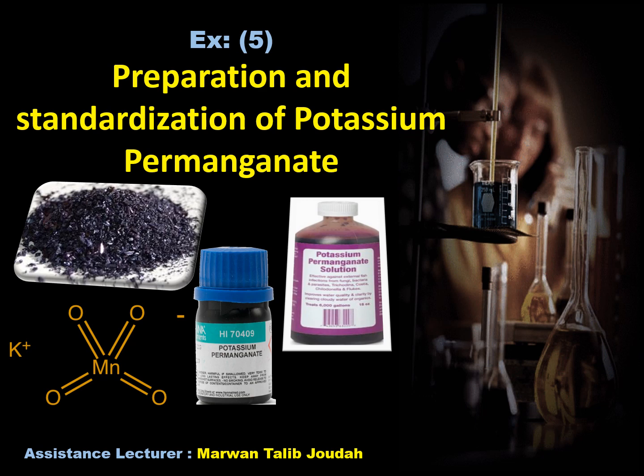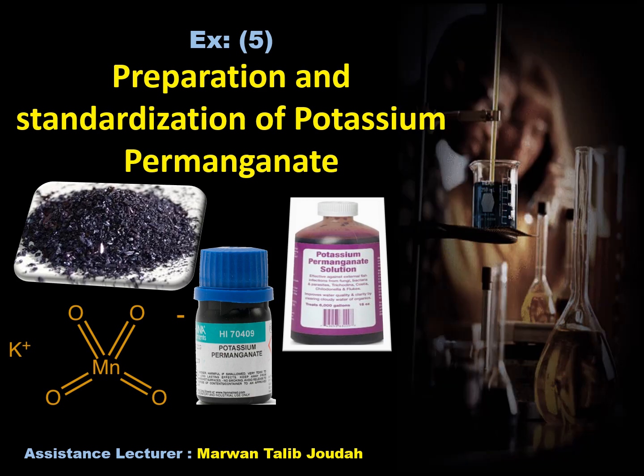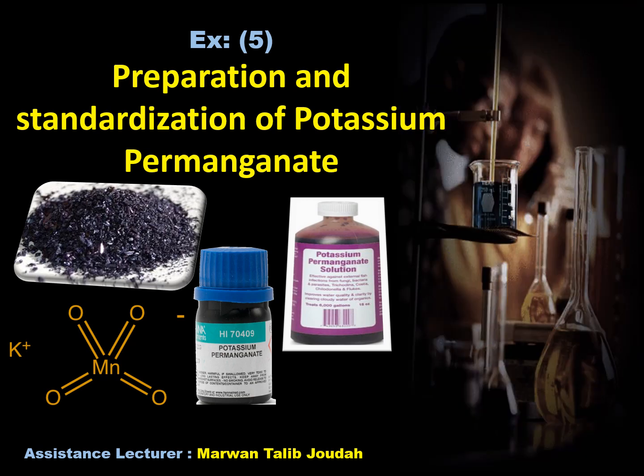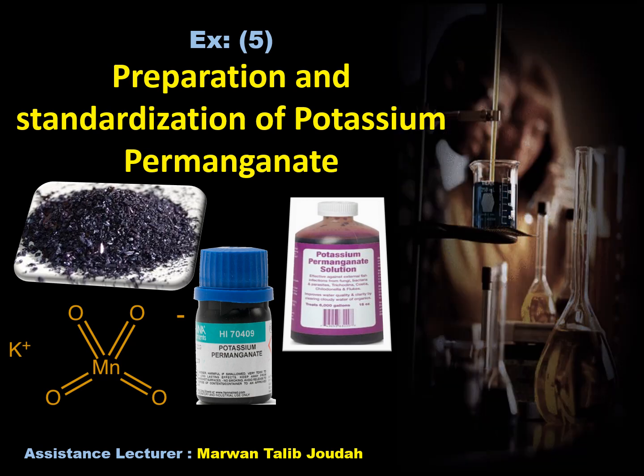تجربتنا هذا اليوم راح تكون التجربة الخامسة اللي هي Preparation and Standardization of Potassium Permanganate. التكنيك راح يكون اليوم اللي هو titration، لكن it's kind of different. اللي راح يصير هنا مو التايتريشن اللي استخدمناه مسبقا. We've had some titration techniques, and they were only acid-based titrations.